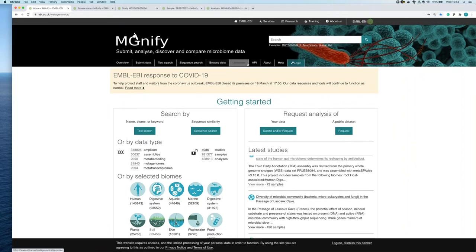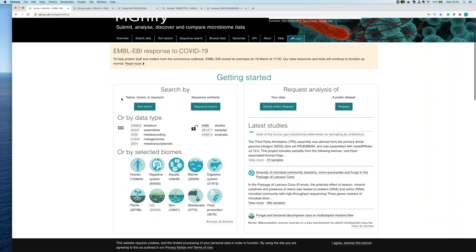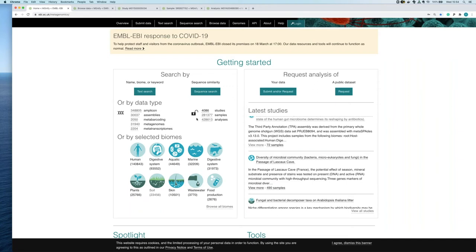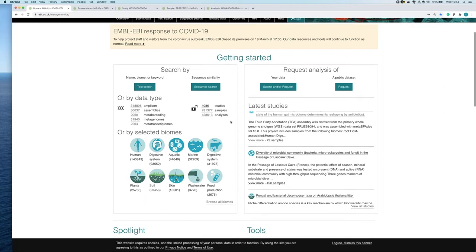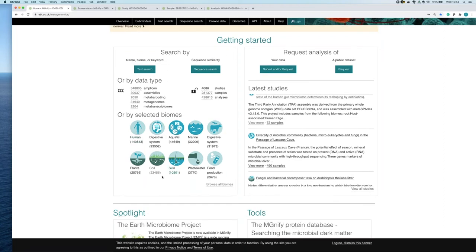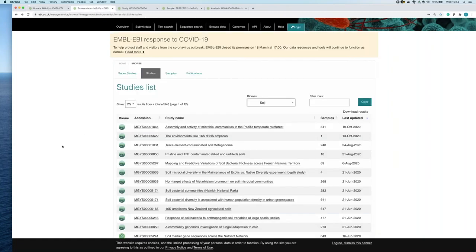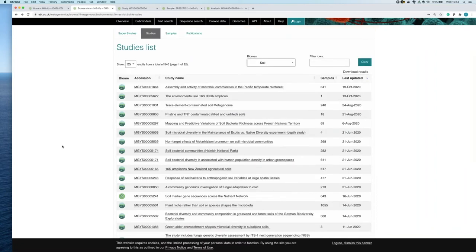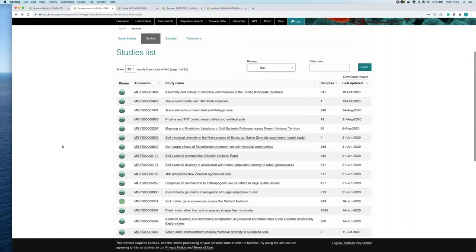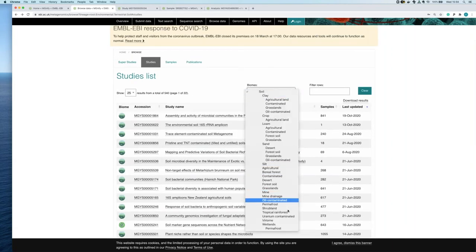There are several tabs at the top for navigating the website. I also want to draw your attention to the API feature, which allows you to download datasets — there's an upcoming webinar from my colleague Martin on that. You can browse data in several ways: by data type, by data flow (studies, samples, analyses), or by biome. For example, browsing by soil shows a list of all studies related to soil environments, and you can drill down further to a specific soil type such as grasslands.